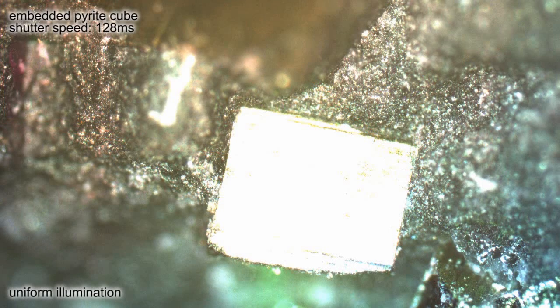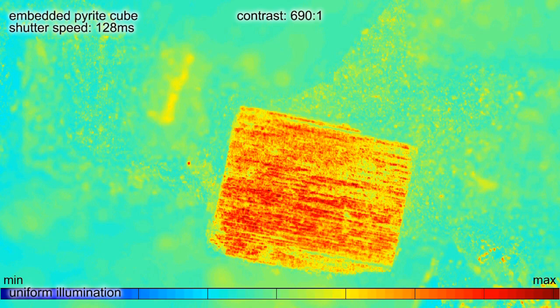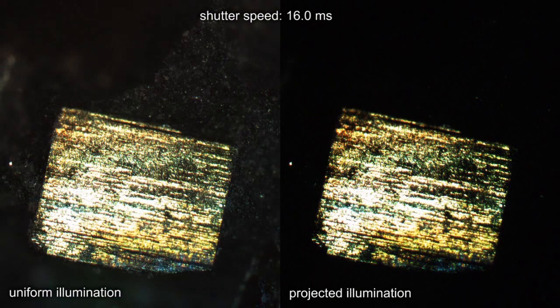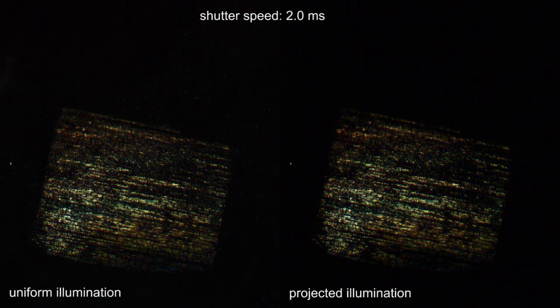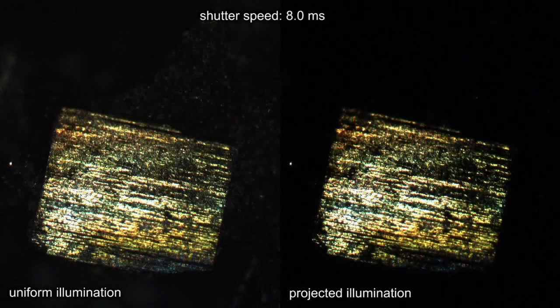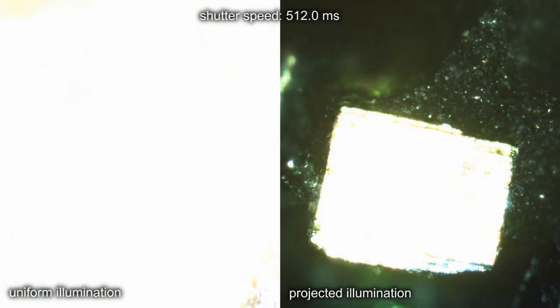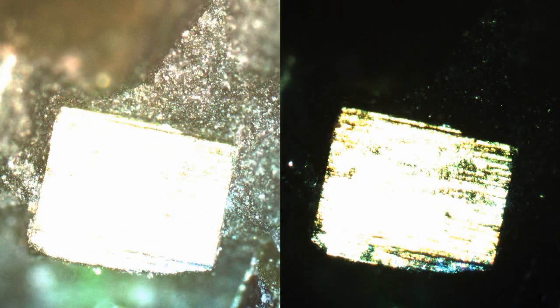In particular, reflected illumination microscopy suffers from poor visibility of low contrast specimens or strong reflections and scattering. By first modulating the illumination with the projector and a second time by the specimen, we can enhance the contrast of the optical image that is observed through the oculars. Note that the optical image exceeds the dynamic range of a single-shot camera image in this example.